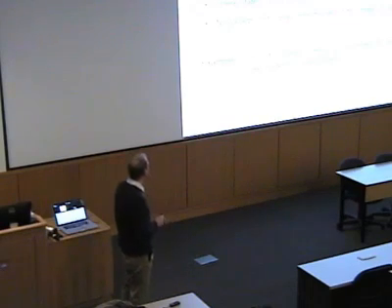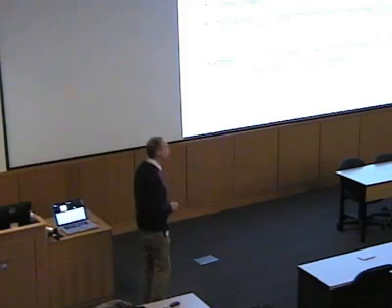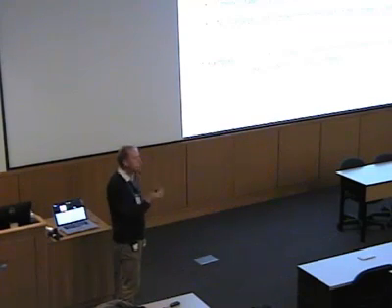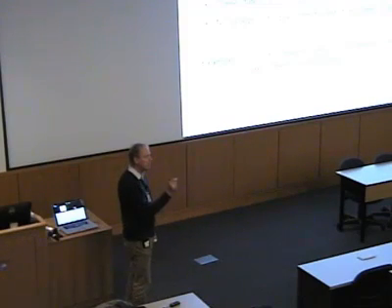We can see these paramagnetic states. What's really important, though, is that there are no background signals from the rest of the system. We only see the paramagnetic species that's present. In the last talk, we heard that if we're going to use IR spectroscopy, for example, and look at a protein, we have thousands of atoms and therefore thousands of vibrations. Finding out what's happening at a catalytic site is difficult.